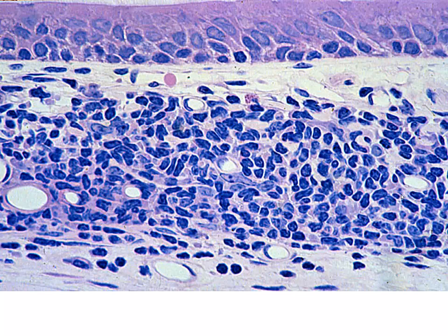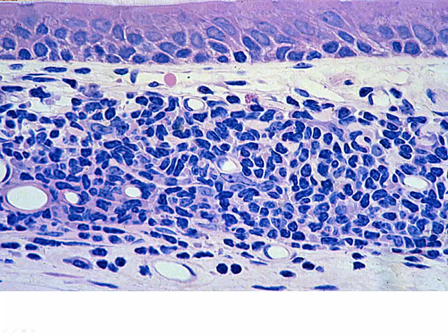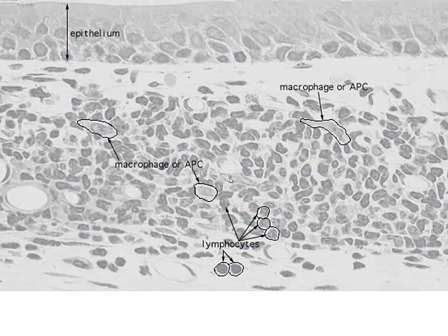They're larger cells. Now that you point them out and go back and forth, you can somewhat pick them out. I would wager we possibly have another macrophage right in here as well. But at this magnification, I would not ask you to identify any particular individual cell in these.